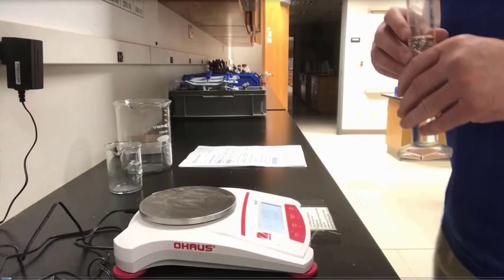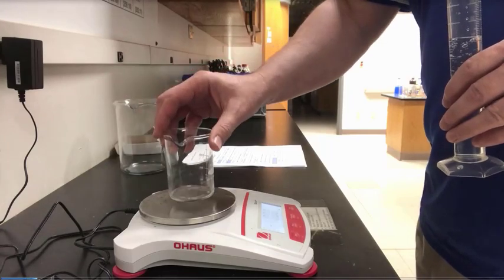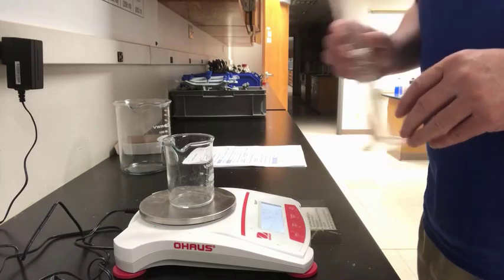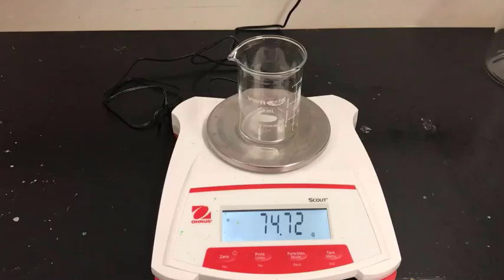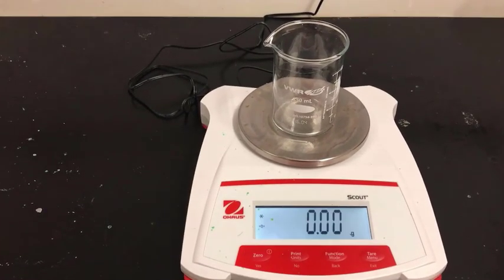So let's take a look at some of the experiments you'll be performing. The first one here, looking at the accuracy of a graduated measuring cylinder compared to a flat bottom beaker, which is inaccurate in its measurements of volume. So here I am. We'll take a flat bottom beaker, probably a 150, and we're going to add water until the mass is 40 grams.